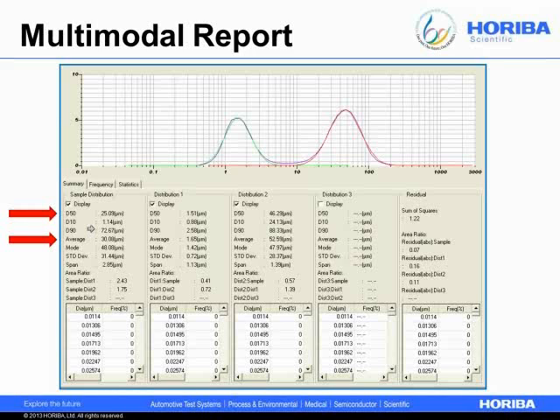And the D50 comes in at about 25 microns. And this is curious because at 25 microns, which is roughly around this spot, you wouldn't think that that is any interesting point, right? If you're going to be monitoring the dispersion state of this material or the milling state of this material, you probably wouldn't want to choose a point that seemed to be in the middle of both modes. And the mean value at 30 microns is kind of in the same boat.